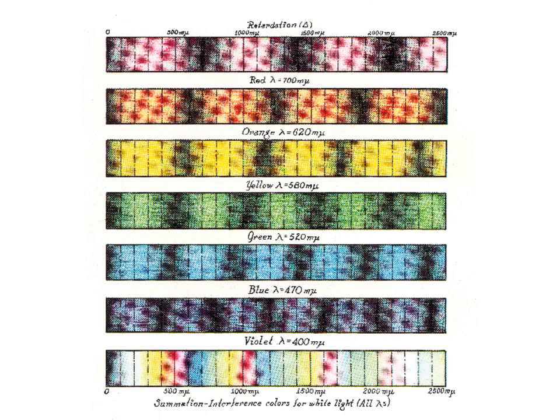Now, what we haven't talked about yet is what colors are actually produced by the interference patterns of the two split light rays that pass through the upper analyzer. First, let's consider a red light source. So every 700 nanometers of retardation, the two light rays destructively interfere with each other and are blocked by the upper polarizer. So that means no light is seen. The same is true for all the other colors in the spectrum, for their own characteristic wavelengths. And also for a mixed white light source, which will add up all the different wavelengths into a combined pattern across the visible spectrum that all interfere simultaneously.